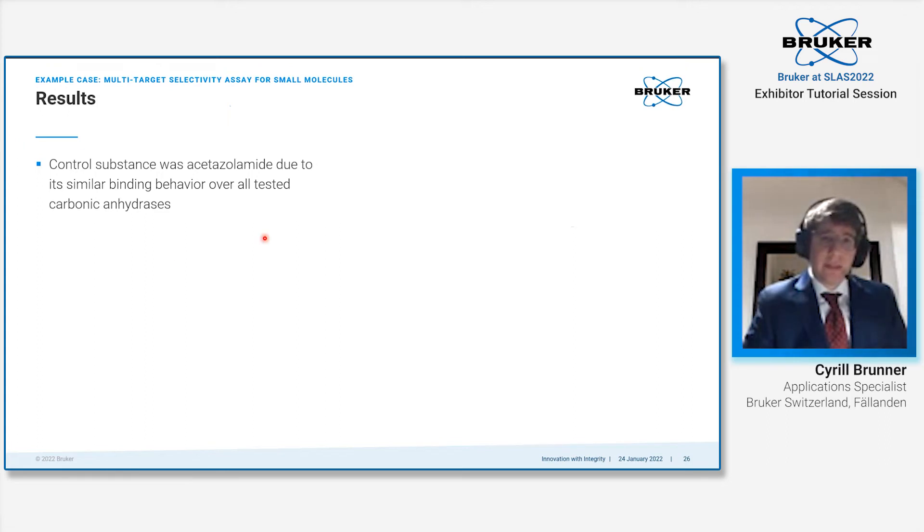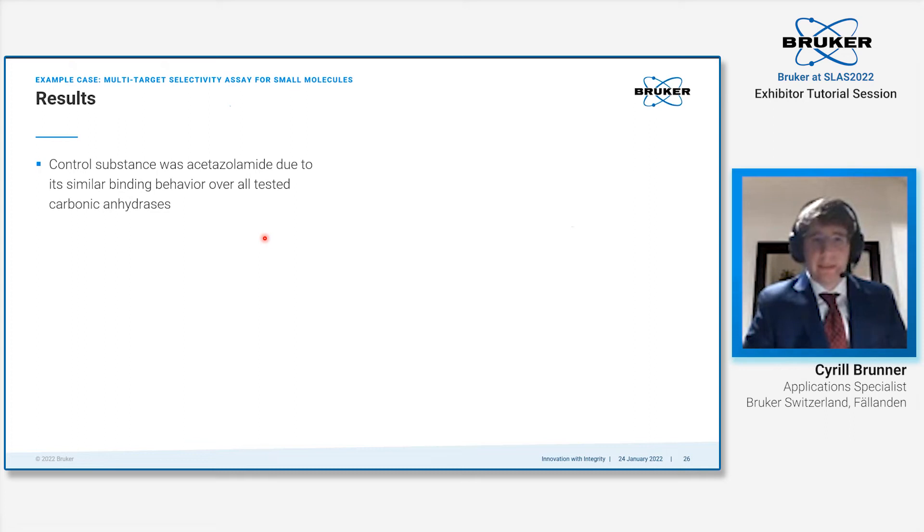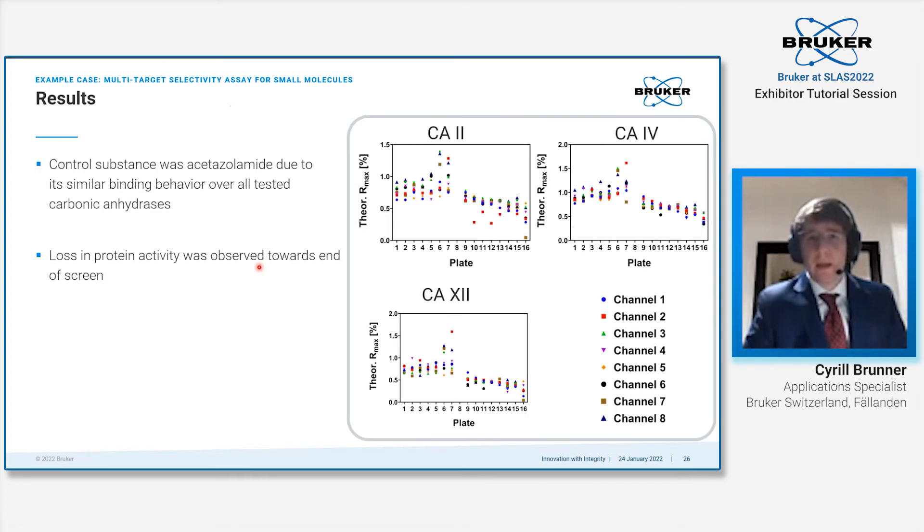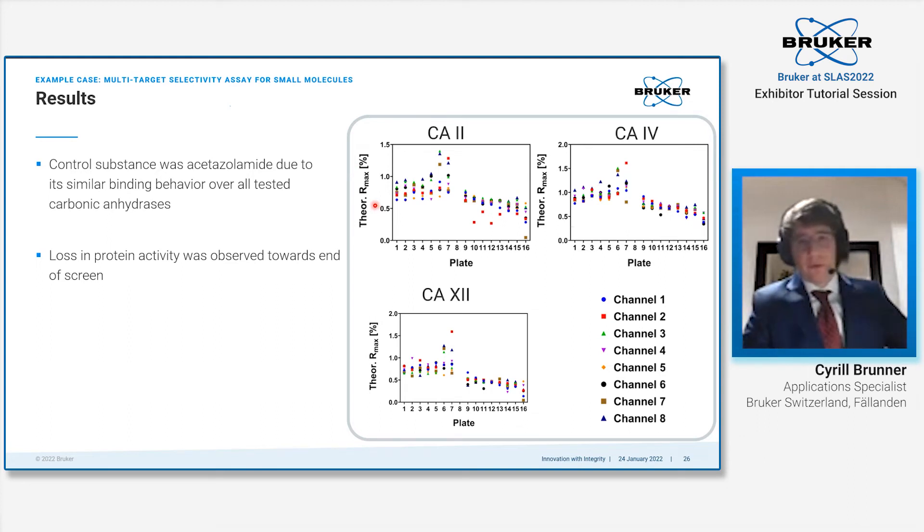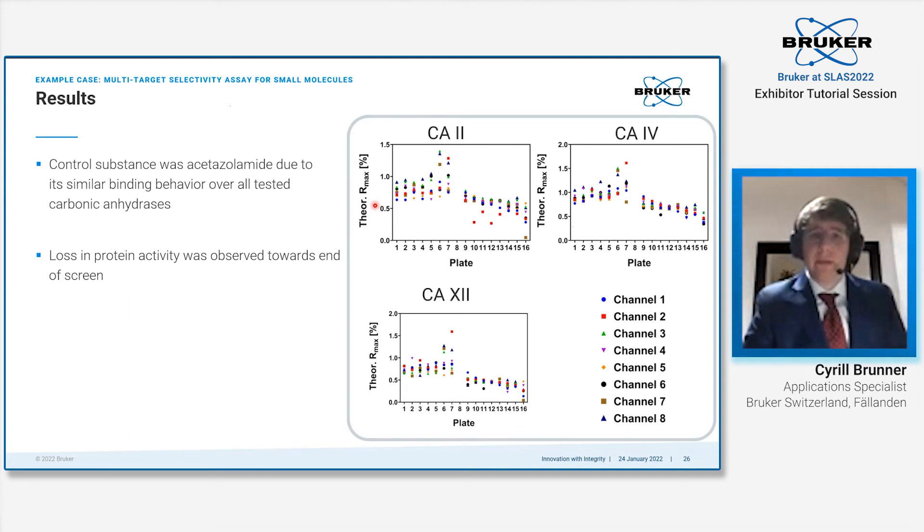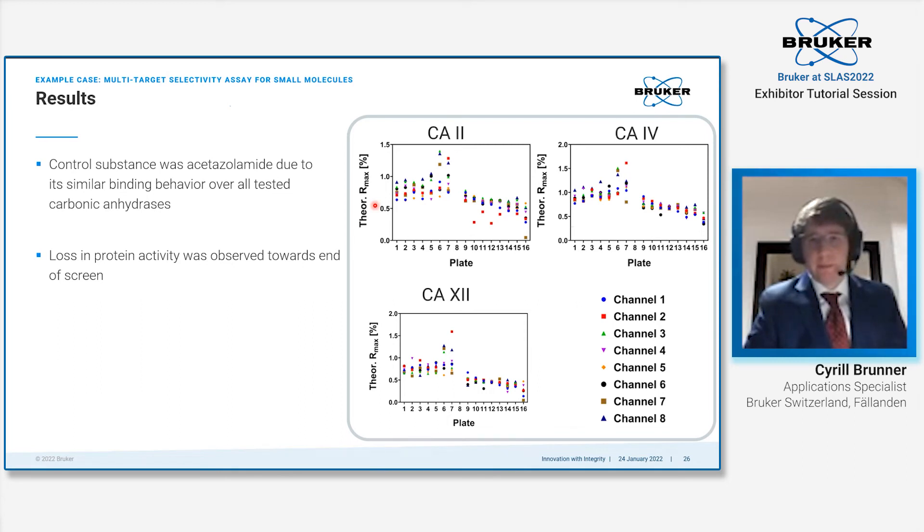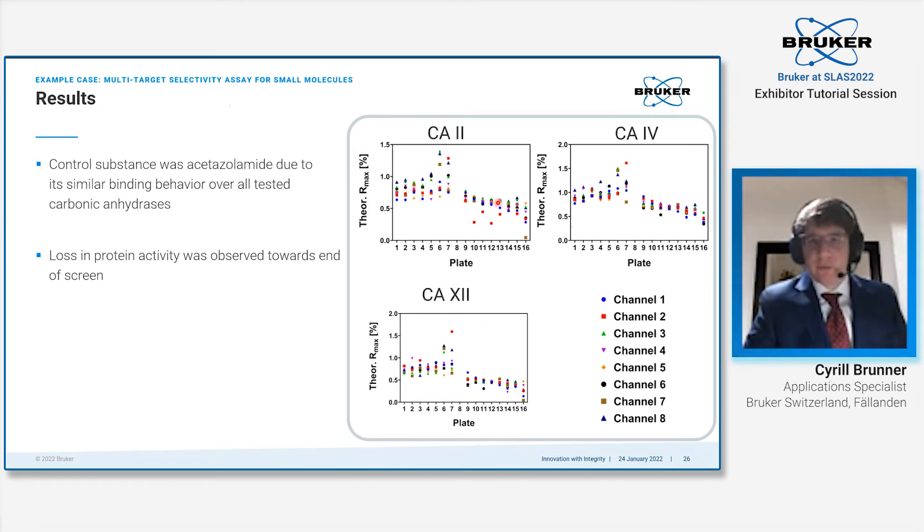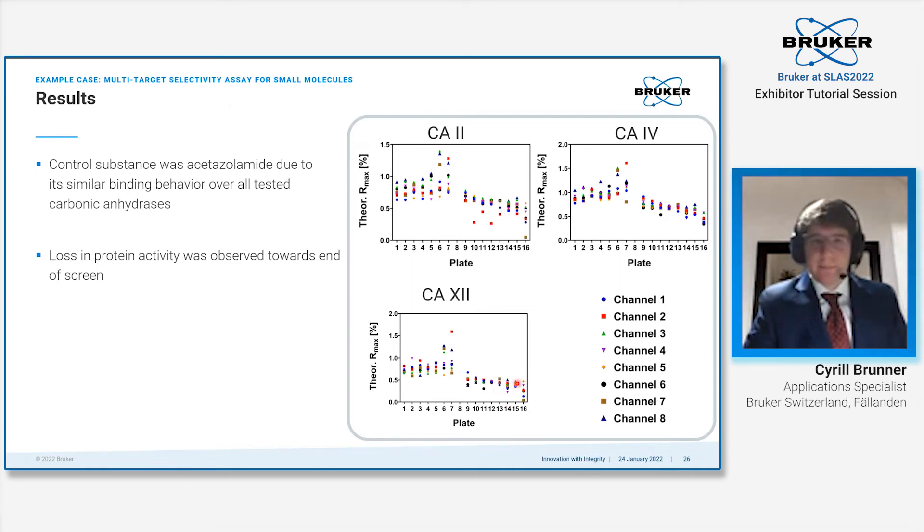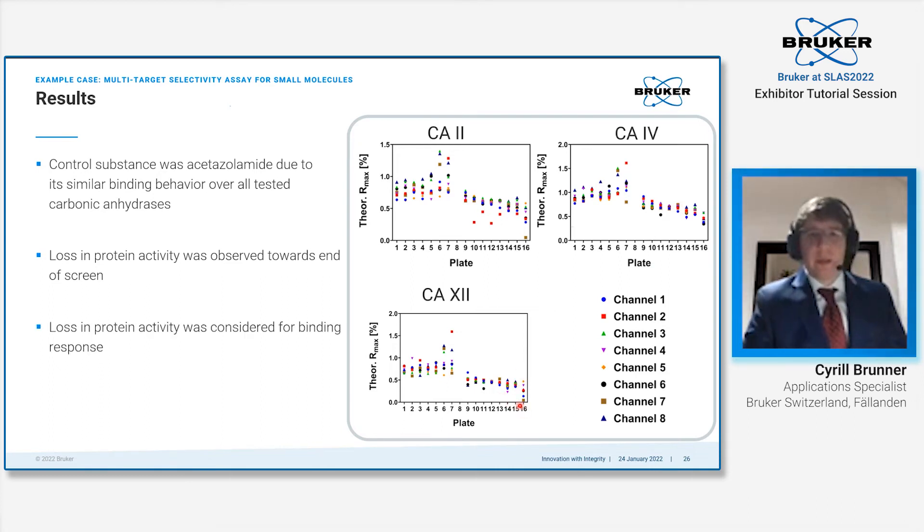As a control substance, we chose acetazolamide because it shows relatively similar binding behavior over all tested carbonic anhydrases. When we look at the responses that we got for acetazolamide over the course of the experiment and compare it to what response we would have expected based upon the immobilization level, then we see that in the beginning, the responses stay relatively stable for all carbonic anhydrases. However, towards the end, there's a bit of a loss in activity of the protein observed. We obviously took this into consideration while analyzing the data.